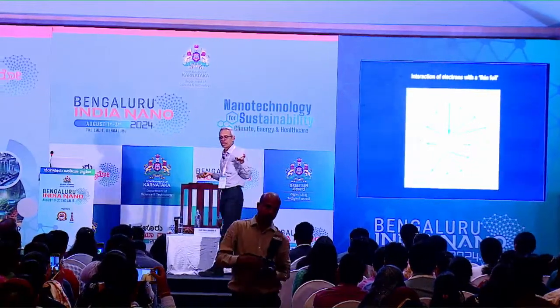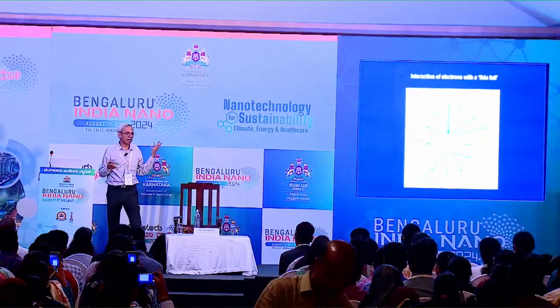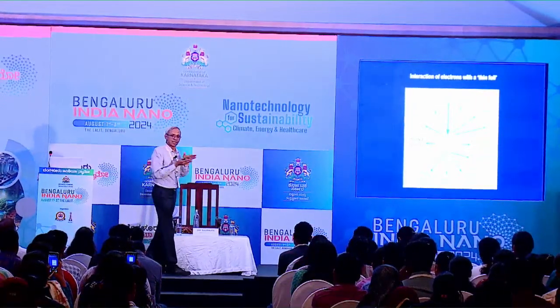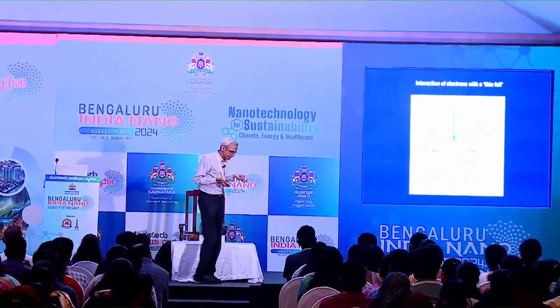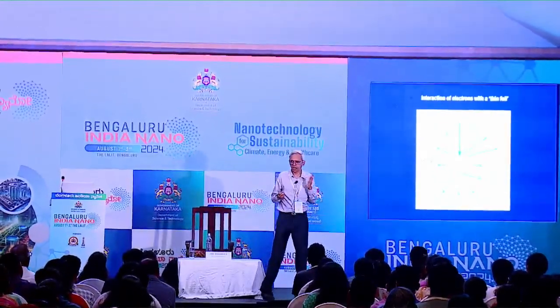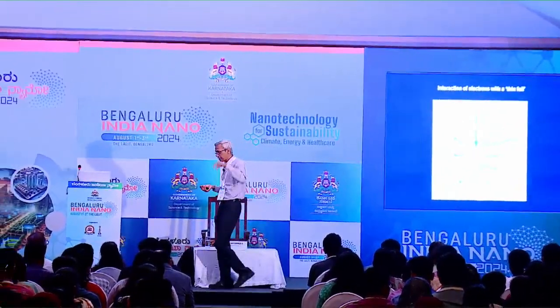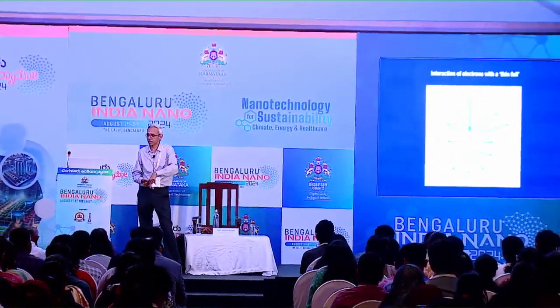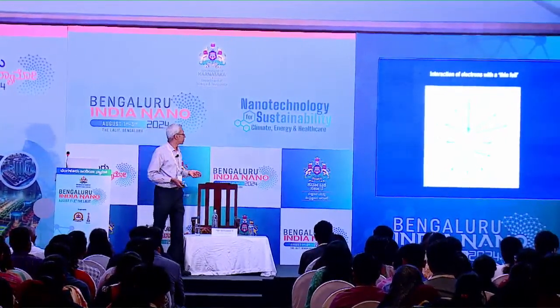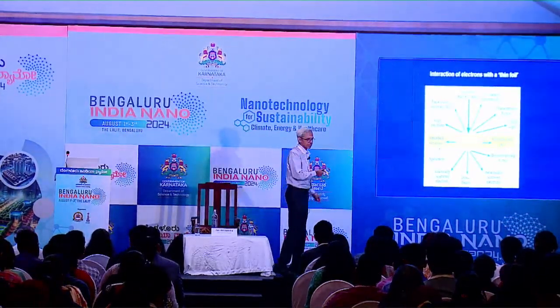Therefore, most nanomaterials, particles and so on, don't require any serious sample preparation. But if you're looking at bulk materials, nano-grained materials, then you have to make them sufficiently thin so that electrons can pass through. And typical thickness is of the order of 100 nanometers, depending on various things. The second important thing is that the electrons have to have high energy, so that they can transmit or pass through the specimen. Okay, so these are two requirements for the TEM, and therefore you can have all these kinds of interactions.